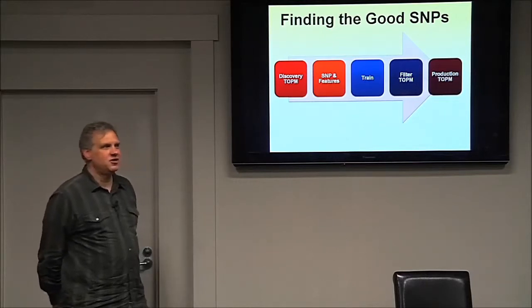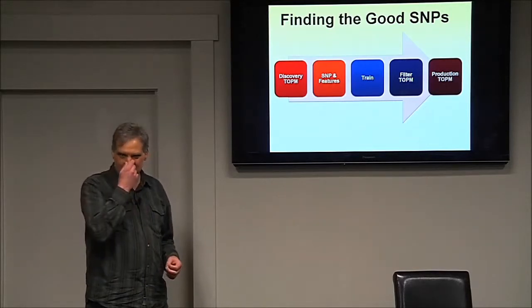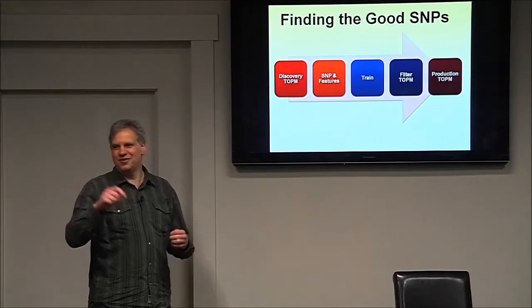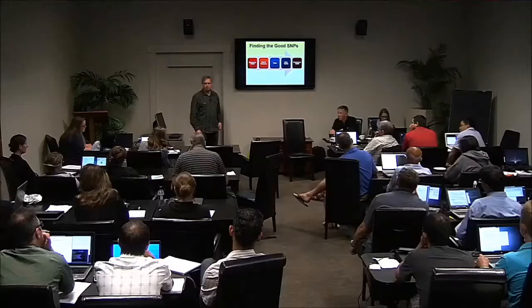What we're going towards is an HDF5 that holds everything and holds all kinds of annotations about each site, and that could definitely be one of the annotations: this is the SNP with this name in this other panel. So whether it's the 50K or some other SNPs available in maize, that could definitely be done, and you could pull that out as a subset. Let's compare against what we saw with the samples in common. Terrific idea.